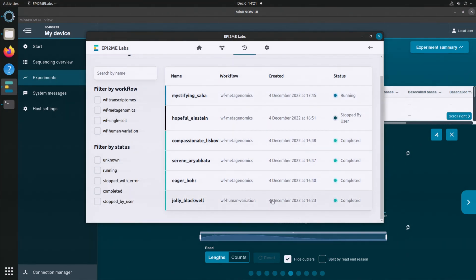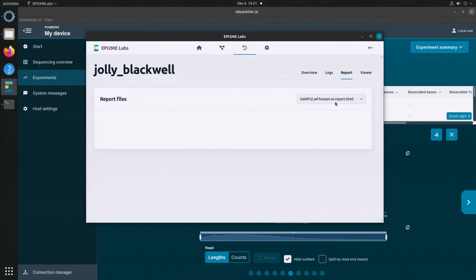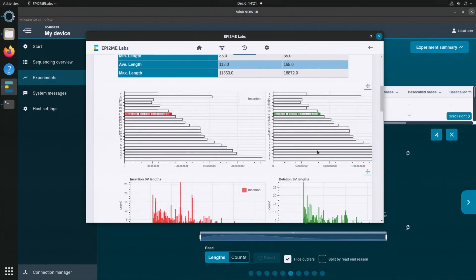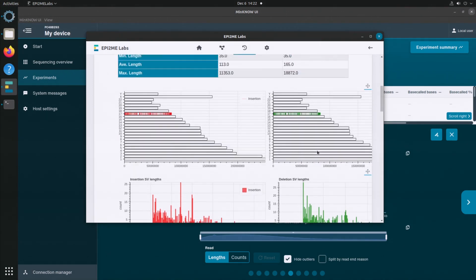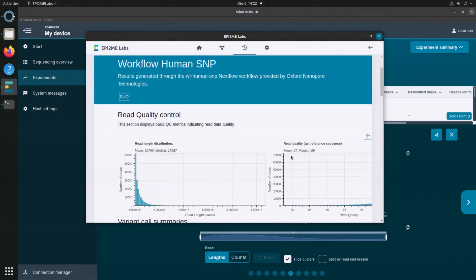We're not going to spend time analyzing the data live — let's have a look at a report that has already been prepared. One of the key features is we have beautiful HTML format reports. They can be shared with collaborators and supervisors. For this workflow we said we want SNPs and structural variations, so we have reports for each. Perhaps more fascinating than just HTML format reports, we now have a track browser where we can explore our data.